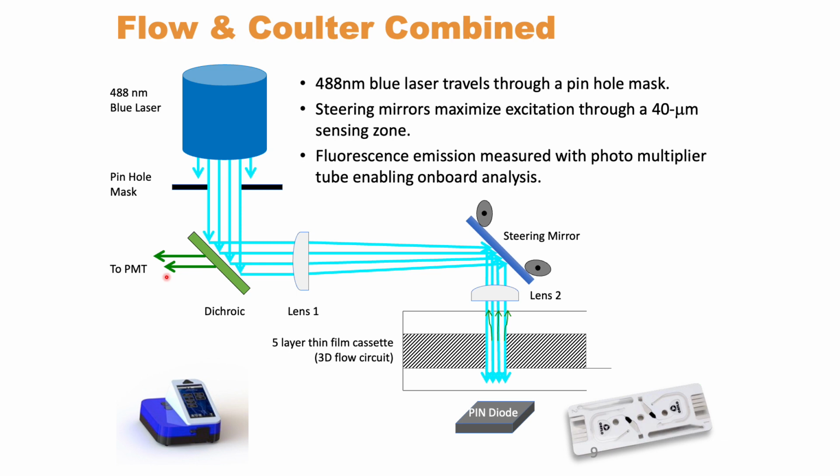So how does it work? The way the cassette works is shown here. So we excite the fluorophore with a laser. So here they're showing you the blue wavelength. The laser will pass through the channel on the cassette. So this is on the cassette right here. So here's the light, comes here. Here is passing through the cassette where the cells will also travel through.